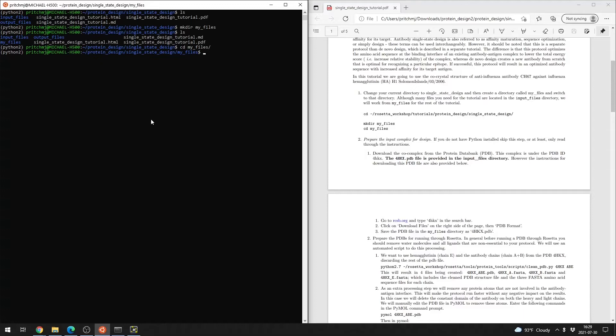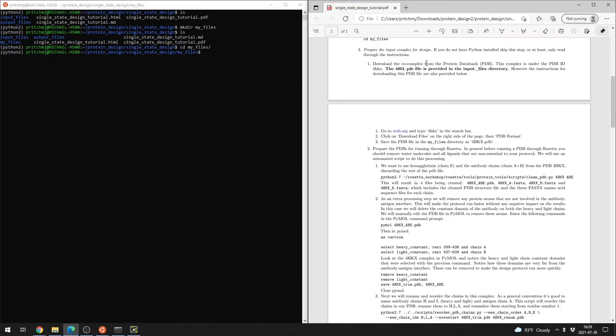Before we get started on the actual design portion of the tutorial, we have to do some pre-processing steps. We're going to get a native PDB, and then do a few pre-processing steps to make it more usable within the Rosetta environment.